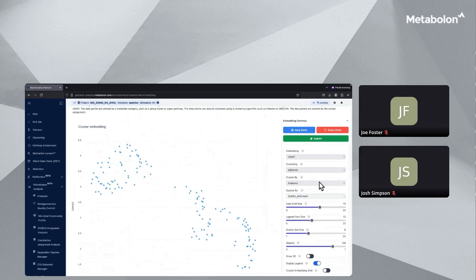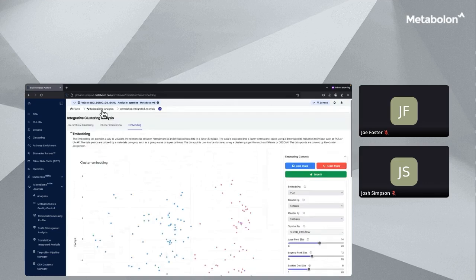Here we provide the options of k-means or DBSCAN as clustering algorithms, and the resulting cluster assignments are used to color individual features on the plot. Embedding highlights microbe-metabolite connections that may not be evident from correlations between individual metabolites and individual microbial taxa alone, and it can reveal additional coordinated patterns within the datasets that might not be obvious upon initial looks. It can also reinforce and complement key associations observed independently in your metagenomics or metabolomics datasets.